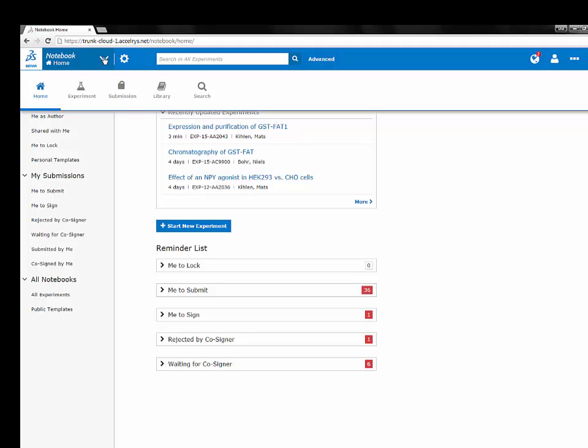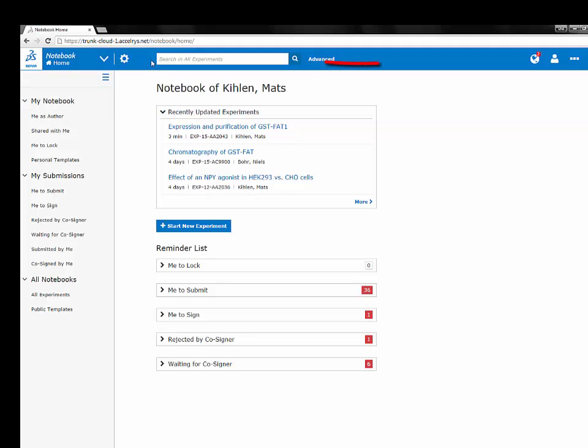In the middle of the navigation bar you have the quick search capability. The search criteria changes automatically depending on where you are. You can always click advanced to access the advanced search tool.